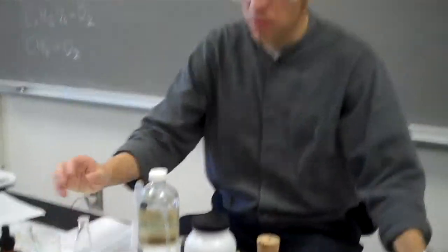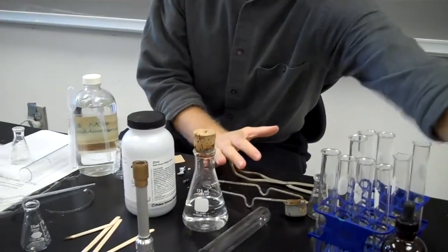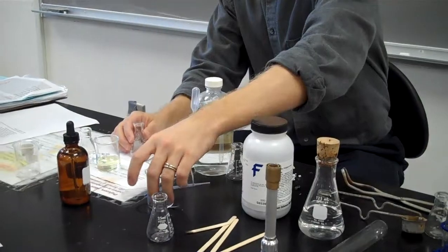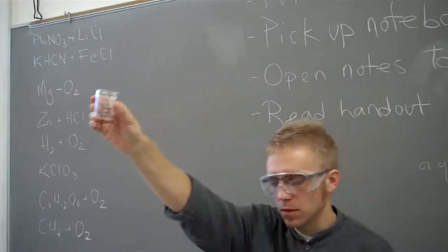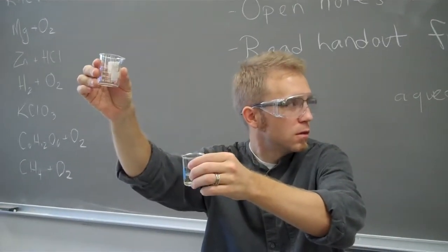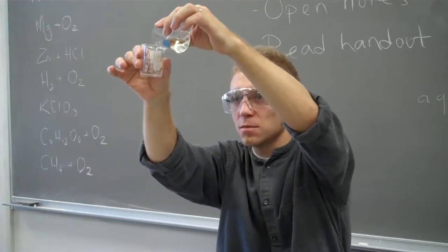Yeah, this will be neat. This will need to record. Okay, beaker. Sodium iodide. Look at the sodium iodide this time.